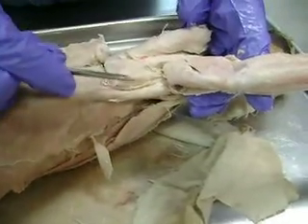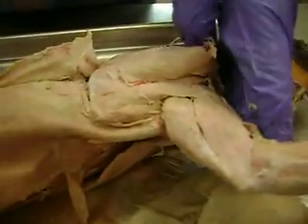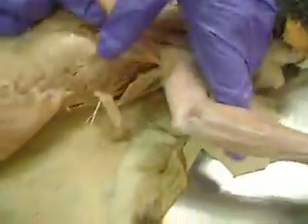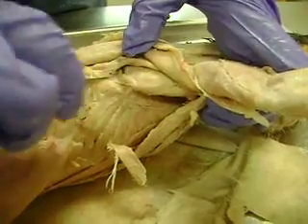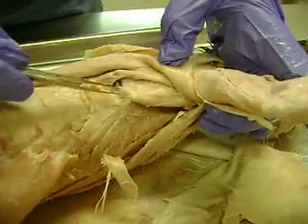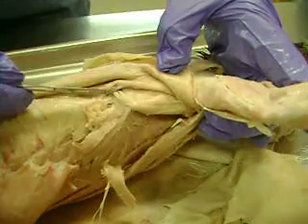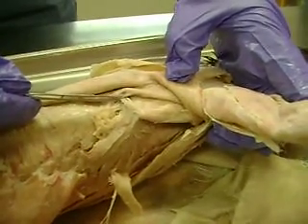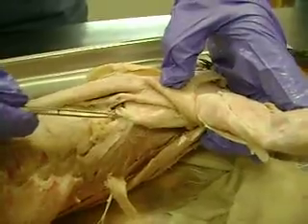And the muscle you see separated right here would be teres major. Again, this is just lifting up latissimus dorsi — this was the teres major I showed you a little bit ago. And this one that comes over here, that's rhomboideus major. So teres major, rhomboideus major — and that's all under the latissimus dorsi.